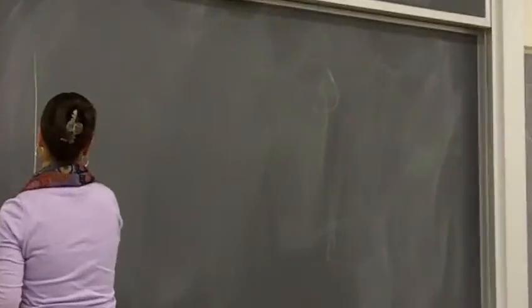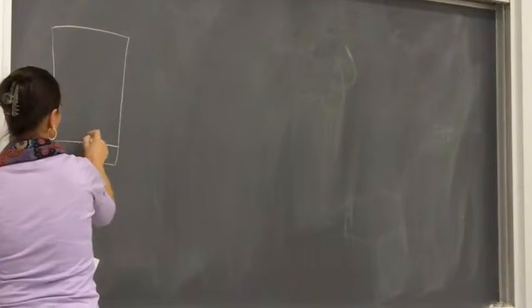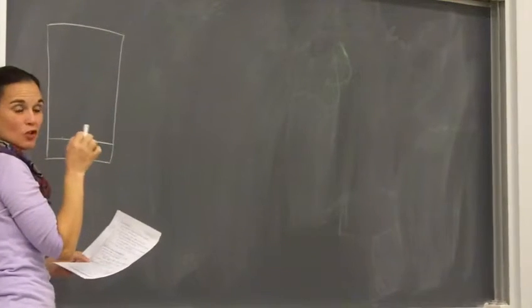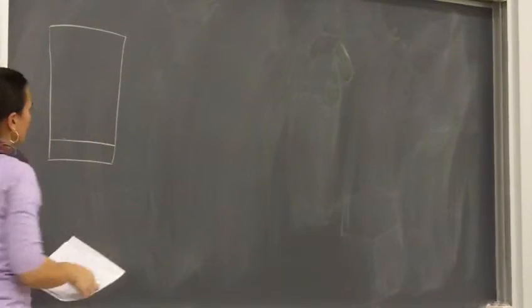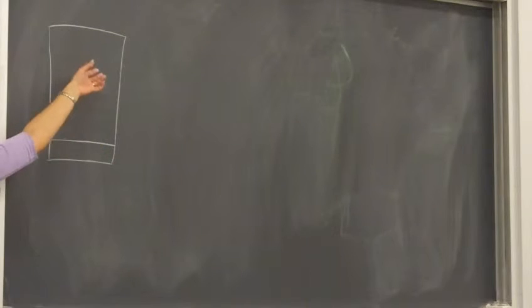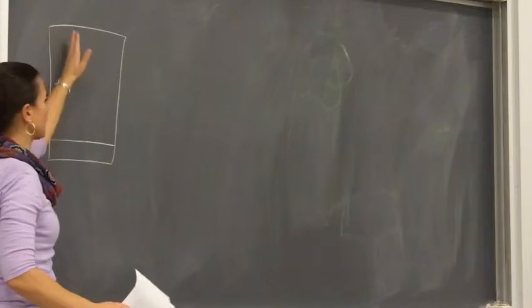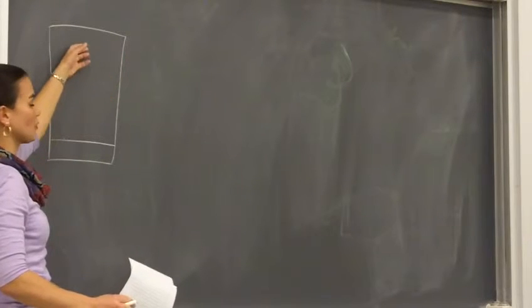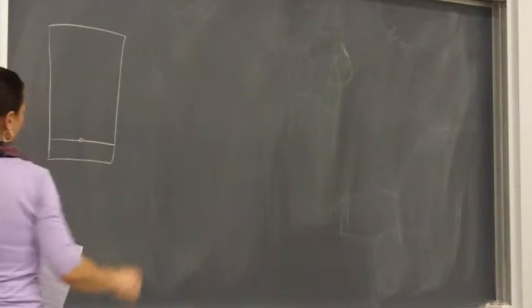So here we have a TLC plate. And we're spotting right on that line, and you want to be careful. You can mark where you've spotted with pencil, but just make sure you don't etch the silica. If you do anything to damage the silica on the TLC plate, then you will interrupt how it travels up the TLC plate, and so the chromatography won't work the way it's supposed to. You need a nice sheet of silica for this spot to travel up, or you won't get repeatable results.